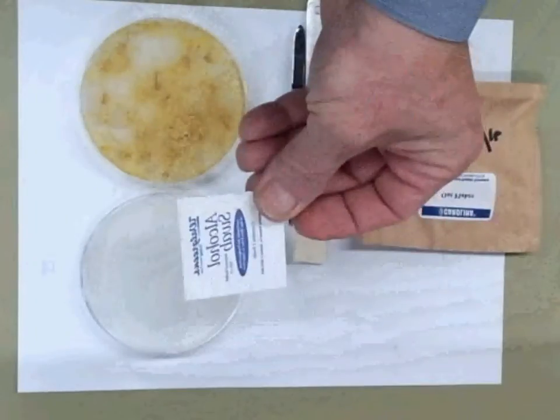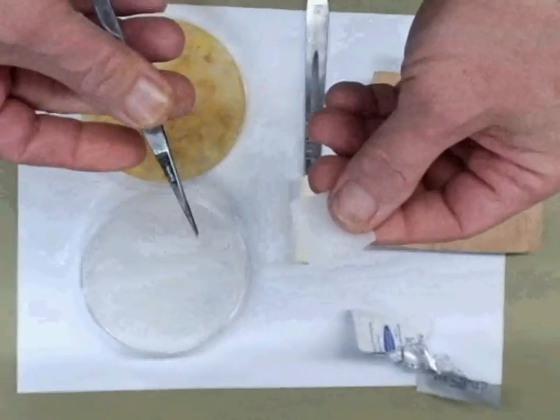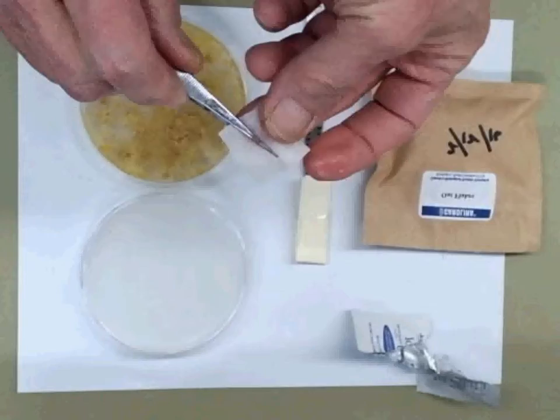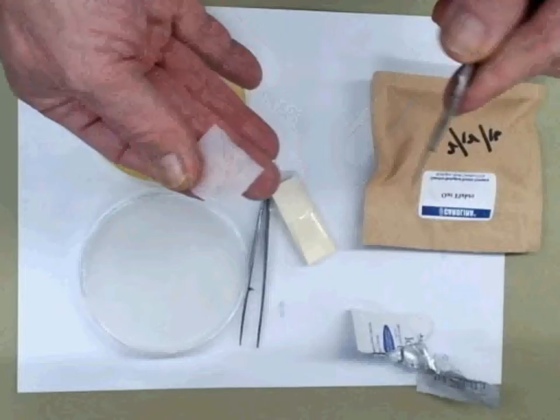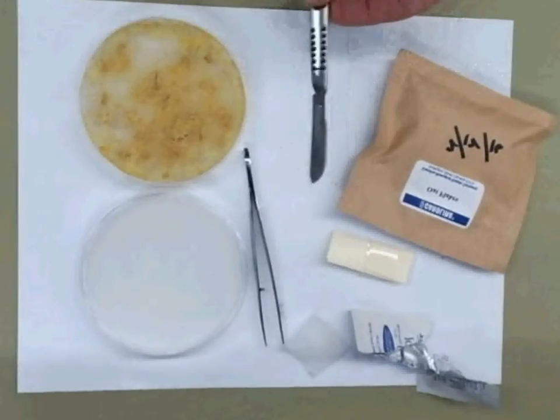The first thing we do is we take an alcohol swab, get that open, and we're going to swab our forceps. Let that air dry. Then we're going to swab our scalpel, both sides, and let that air dry.